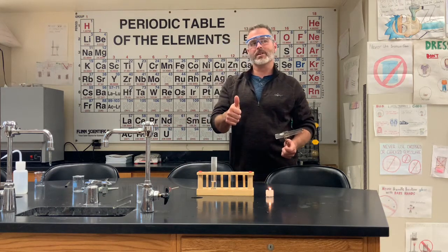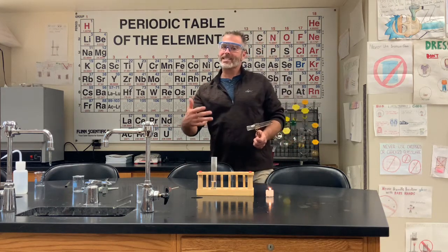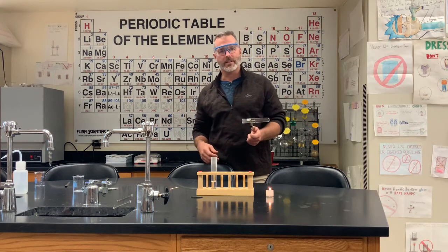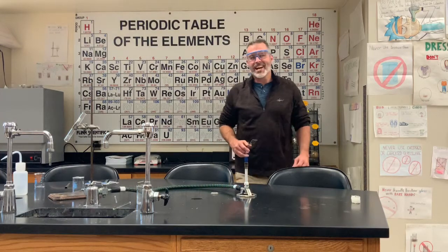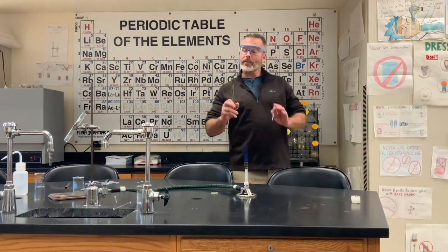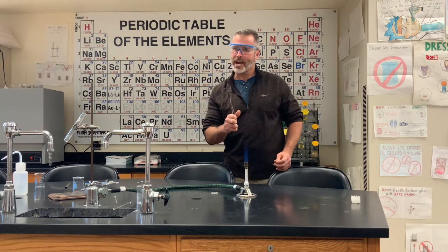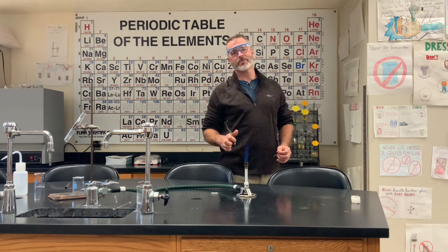So the first reaction, magnesium plus hydrochloric acid, produced a gas. That gas mixed with oxygen. We were able to light it on fire. All right, back at you guys with another demonstration. The last one where we had the hydrogen gas in the test tube with the oxygen, that was a synthesis reaction. And I'm going to show you another synthesis reaction.